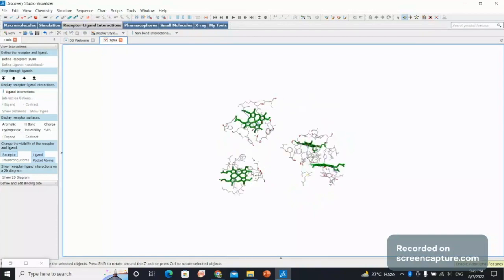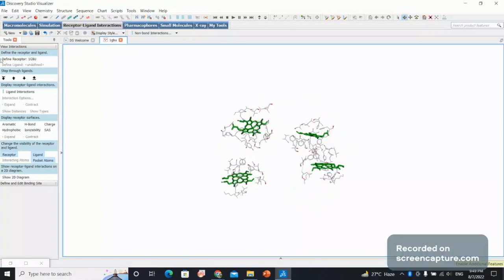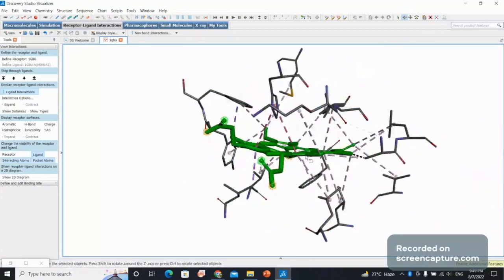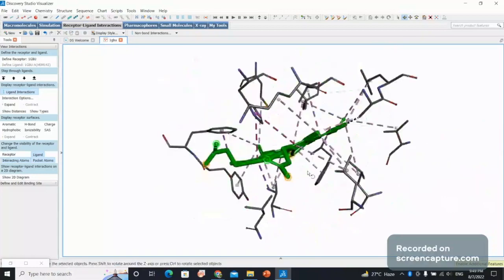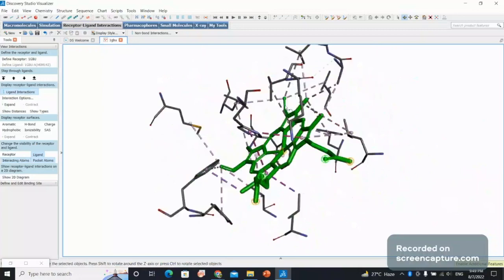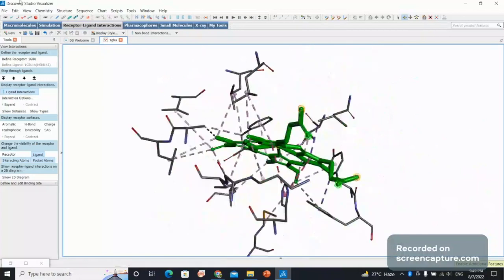So these are the 4 binding sites present within the structure, and in the side view we have the ligand interaction. By clicking on ligand interaction, it will give you the enlarged version of one of the heme groups. Now these are the residues that bind to the heme group, and these residues can also be labeled and the view can be changed to any other form.